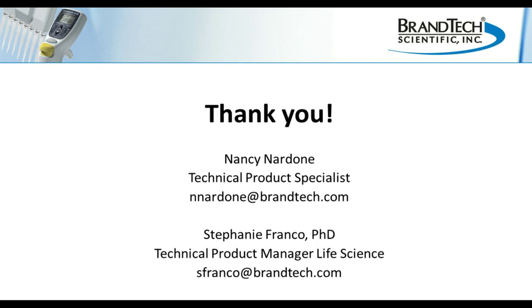Got it. And can you do sample tracking with the benchtop liquid handler? If so, is this something that you can interface with robotic systems? You can do sample tracking within the software. You just set a priority on the samples, and it will track it through the software. The system itself does not integrate with other equipment, but it does produce reports that you can have as an output. Everything that the robot does is very closely monitored by the software itself, and there are customizable reports that you can put any type of information in that you want.